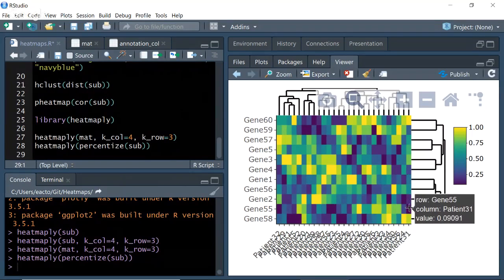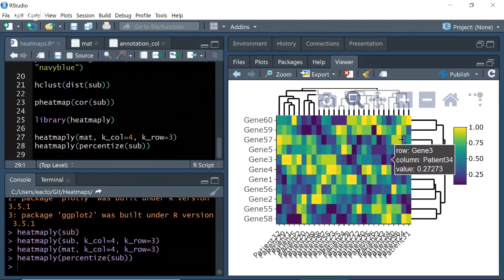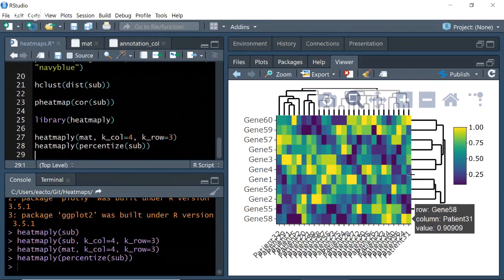If you look vertically down these columns, this is basically saying, if I'm looking at this yellow, 95% of values are less than this value. 50% of values are less than this value. So this is the highest value for this patient.